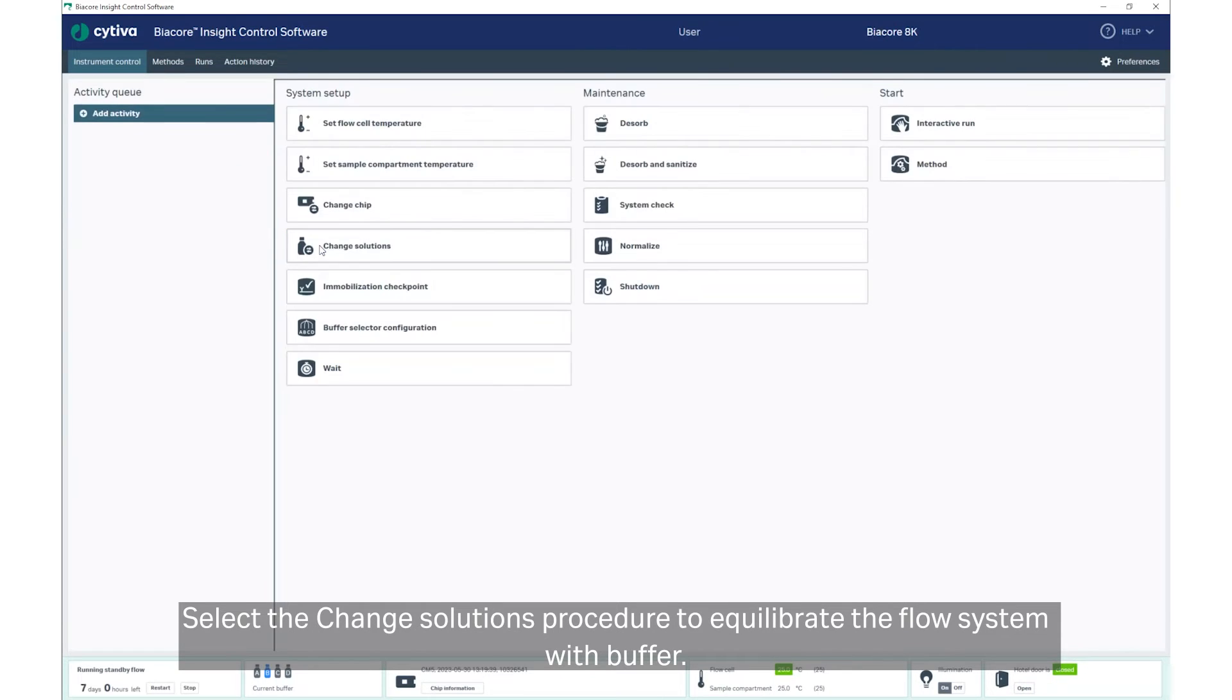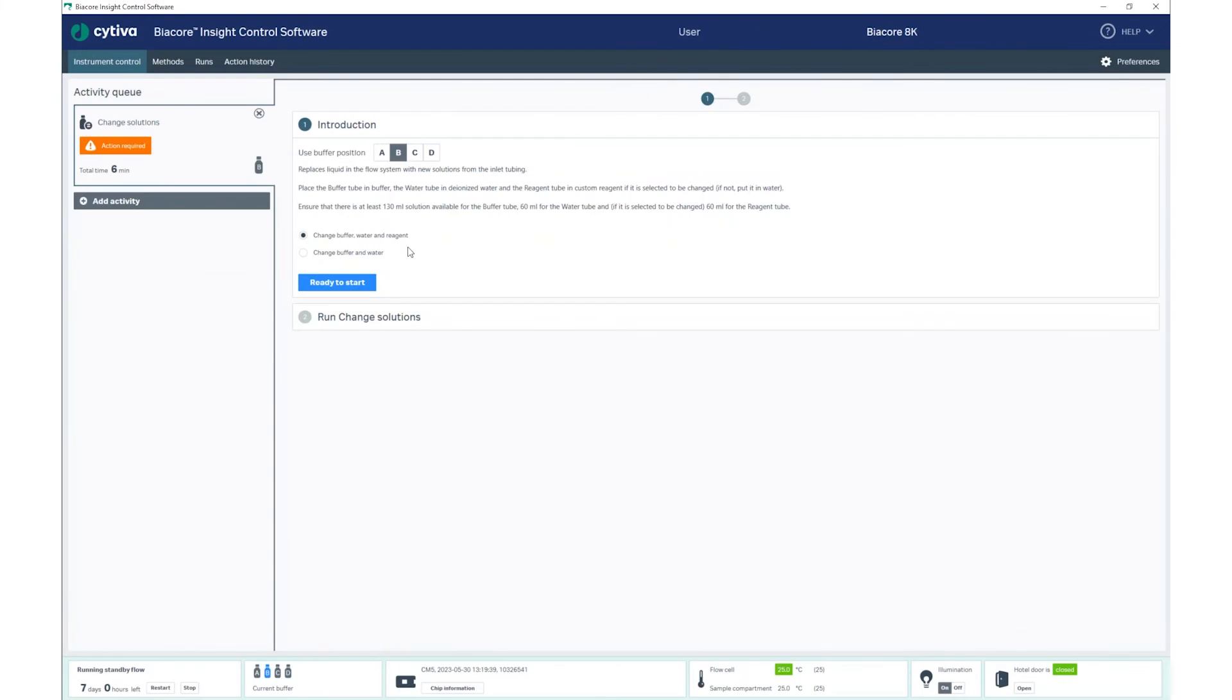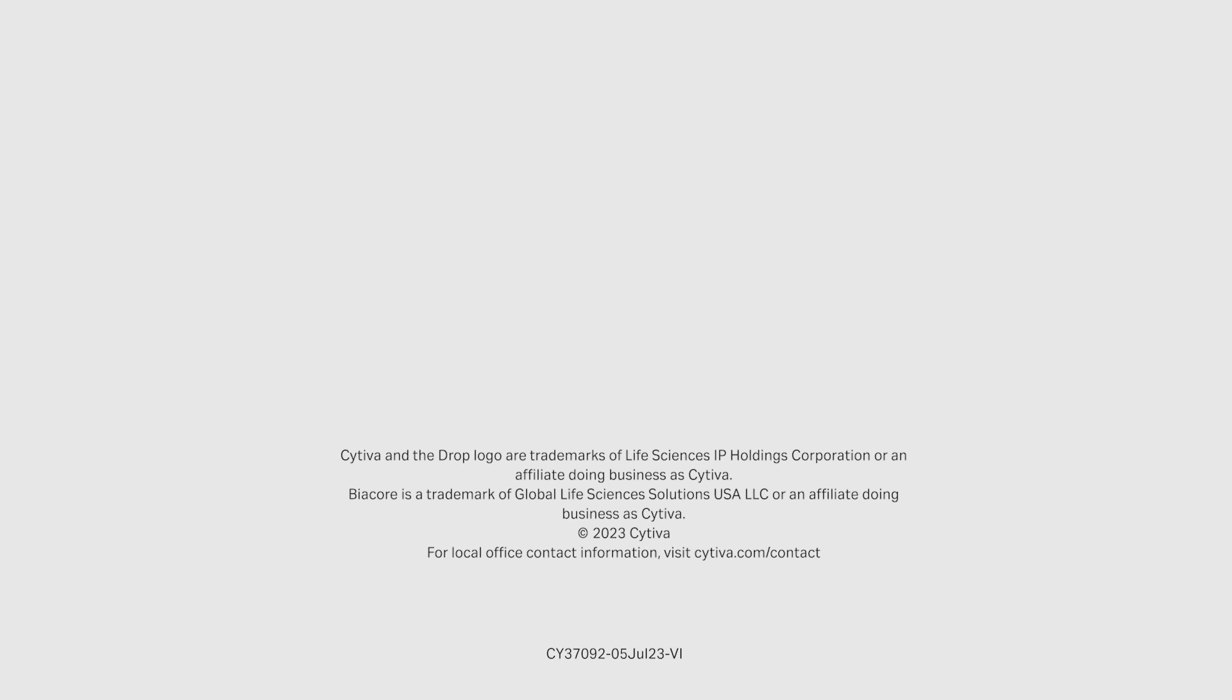Select the Change Solutions procedure to equilibrate the flow system with buffer.